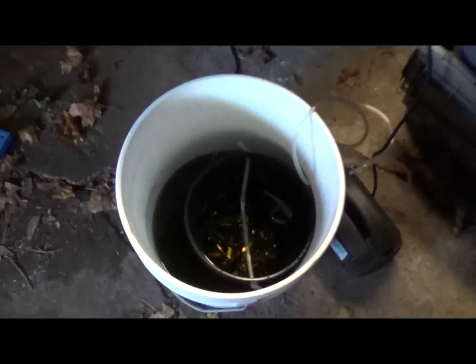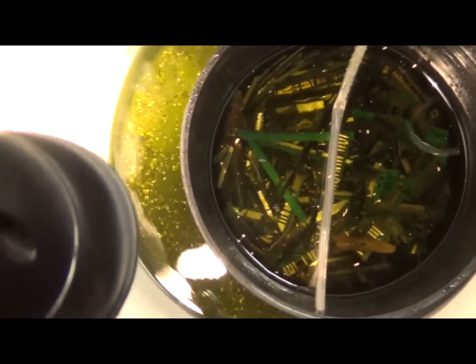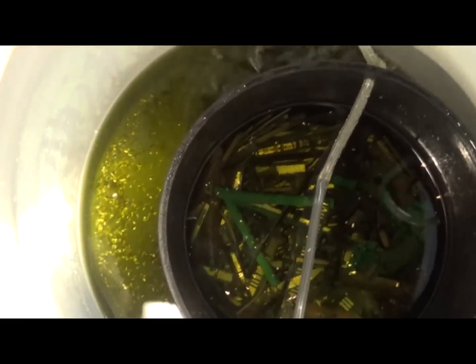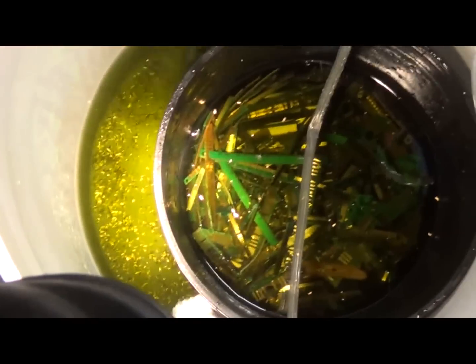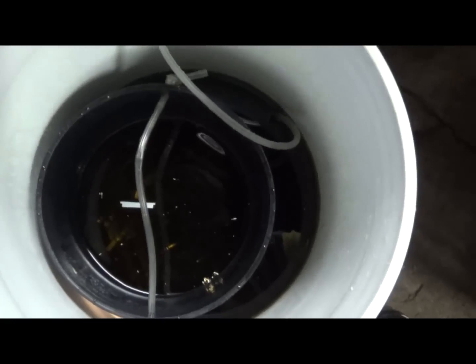Let's take a look at day two. You can see all those gold foils at the bottom there. Indeed, my zip ties were made out of nylon and now they are no more — so make sure you're not using nylon zip ties. That's all the foils at the bottom so far, and there's still quite a bit of foils left on all those fingers, so we're going to leave this in for another couple of days.